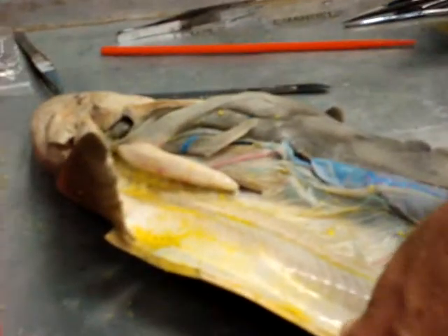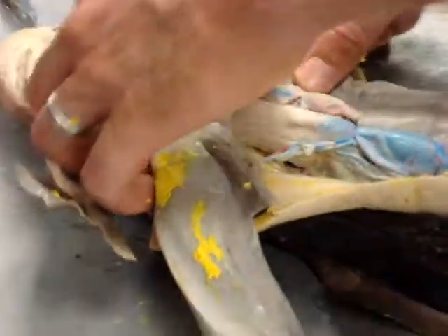All right. The testes in sharks are in a place that you wouldn't expect them to be. They're actually way up here. They are a paired organ like they are in humans and other mammals. We can find both of them by kind of getting around the liver. Okay, here's one. Oh, wow. And here's the other one.